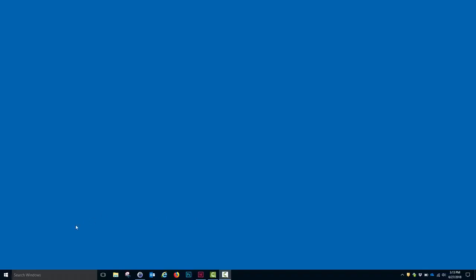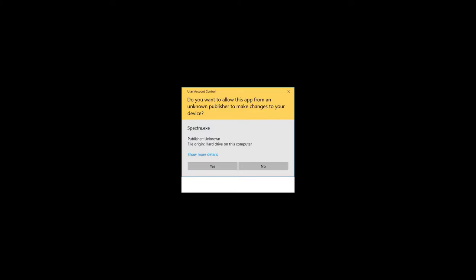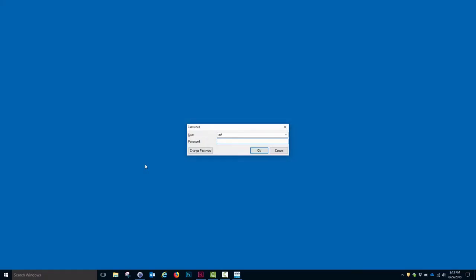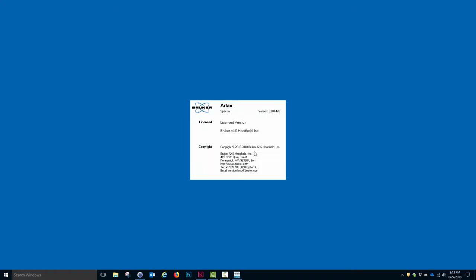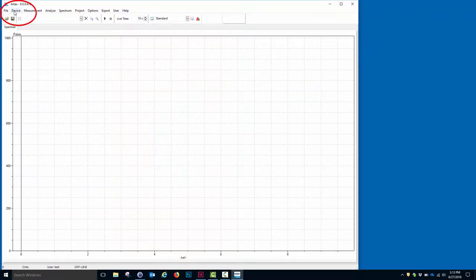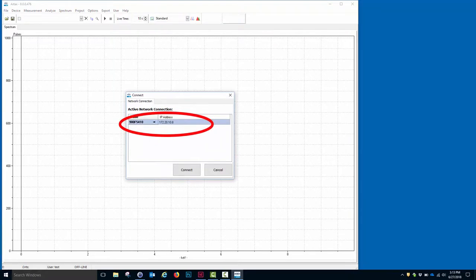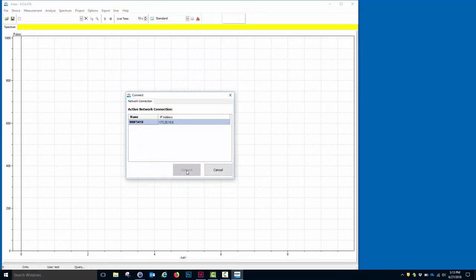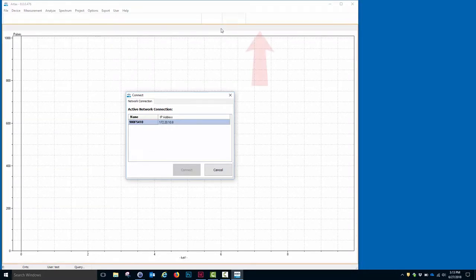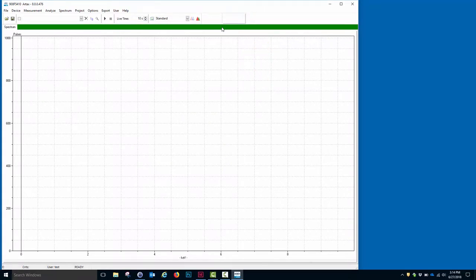We start RTAX by clicking the appropriate icon, which brings us to a warning screen to which we click Yes. At this point, we input the password, which is TEST, and this opens the program. We can connect to the device by clicking Device Connect. This brings up the instrument in this box, and we click Connect. At this point, we get a series of colored bars up at the top of the screen, ending in a green bar for successful connection.